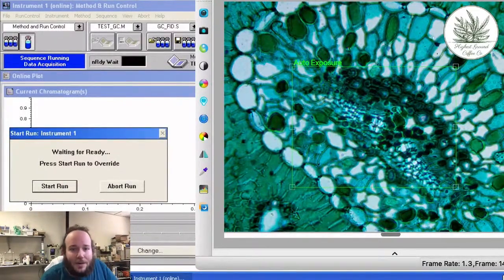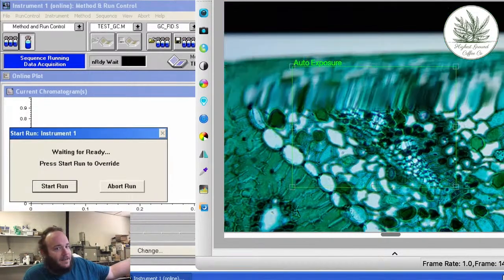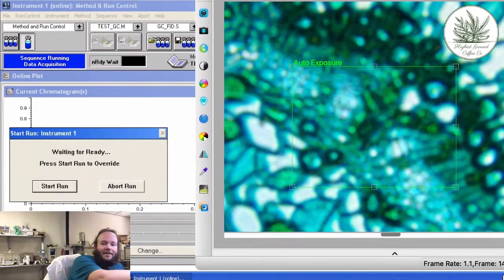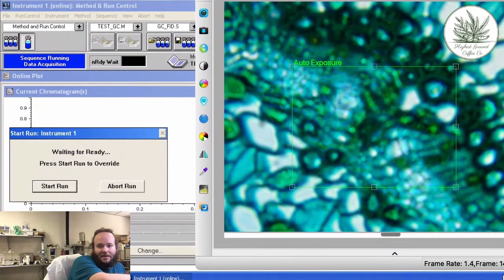That is cool. Look at those cellular walls. How often do you see that? I bet almost never. Any guesses as to what we're looking at here? I'm going to go ahead and move us from the 10x objective to the 20x. Bring us back into focus here.